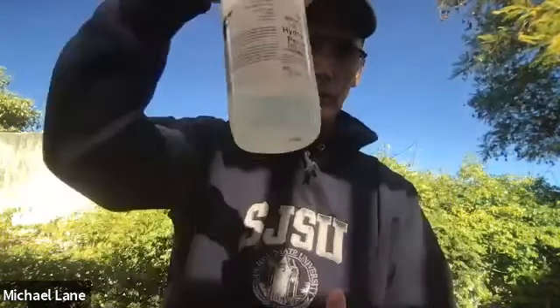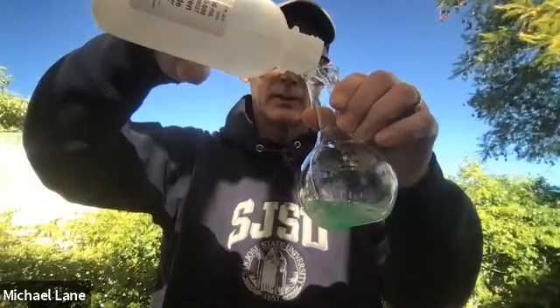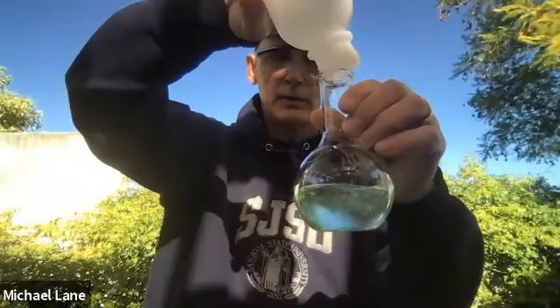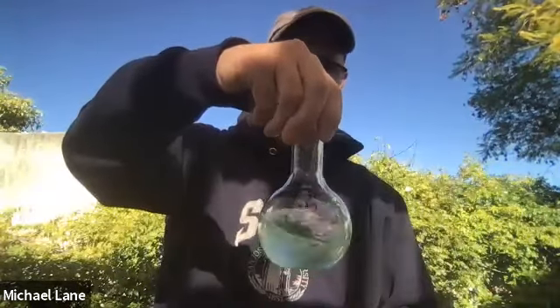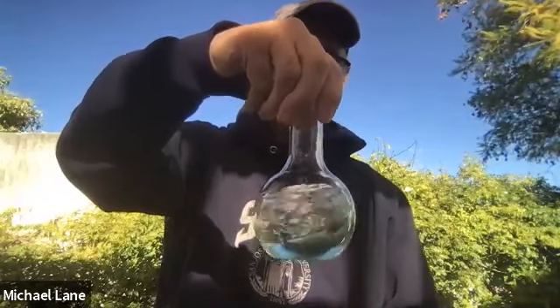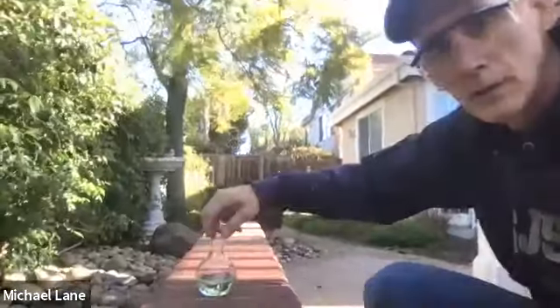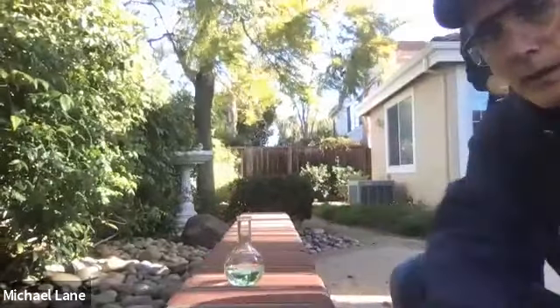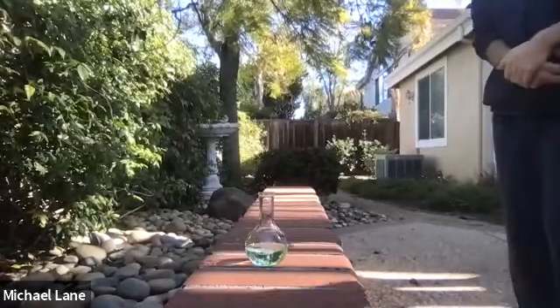All right, I'm going to take the hydrogen peroxide into the container. I don't have a lot of it right now, but that looks to be just about the right amount. So I'll swirl that to get it reasonably mixed. You can see it's taken on a slightly green tint because that was the color of the detergent. Now I've got to find a place to set this down where we can see it, where it's not going to get my computer messed up. There we go. Right about there. Off screen for a moment.